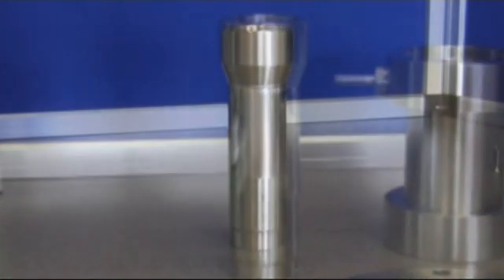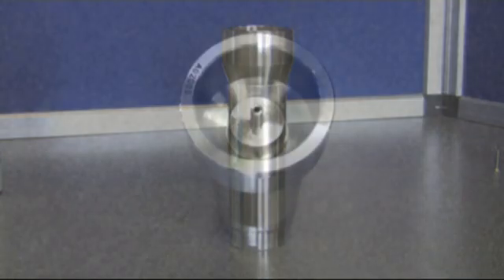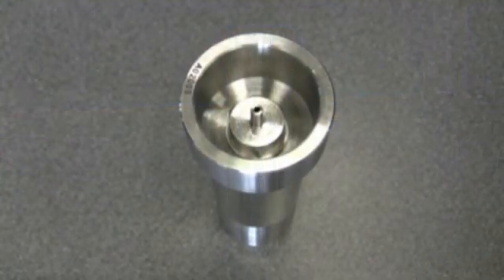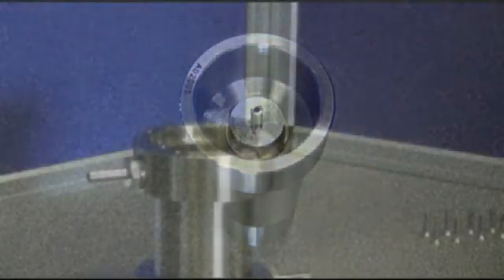The membrane is just about visible as that slightly less shiny bit, about two thirds of the way up. It's on a shaft. The shaft has an inlet port for the material to be dispersed. It goes in from the top there.